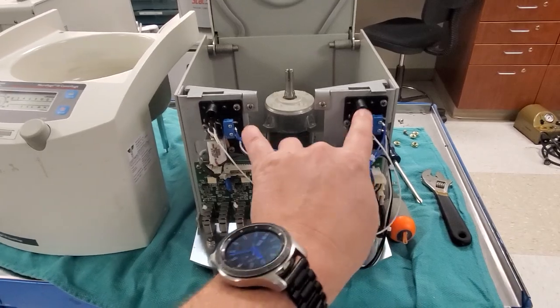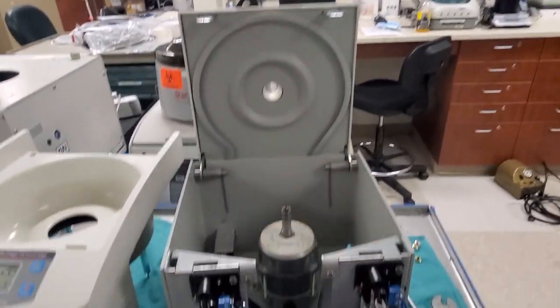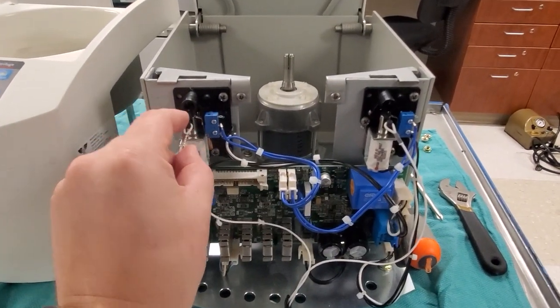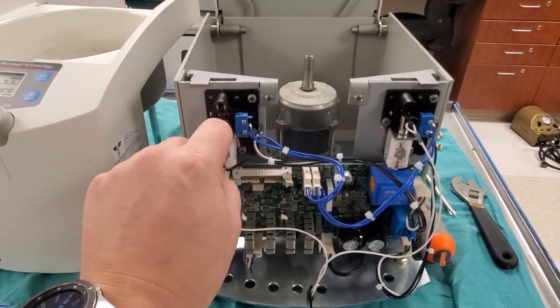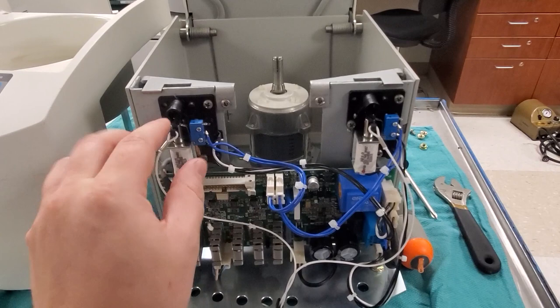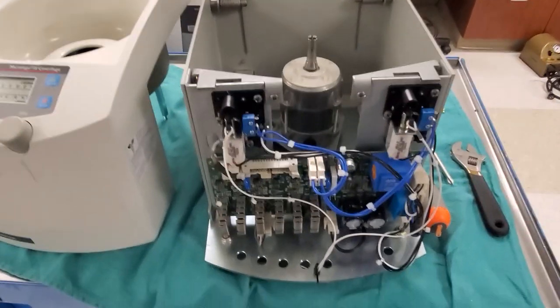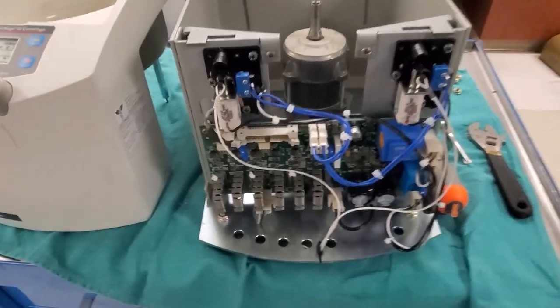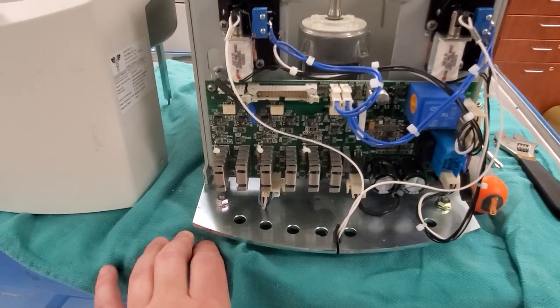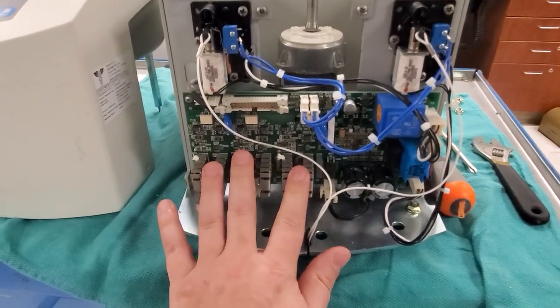We've got two solenoids that release the latches on the lid. Notice they also have detect microswitches, so when the door lid comes down it hits the switches and it knows that it's ready to run a cycle. Now centrifuges are all kind of the same — they're almost all three-phase motors and you can see your motor driver circuit.